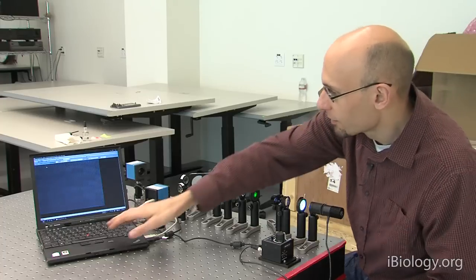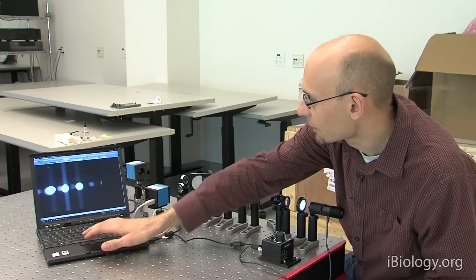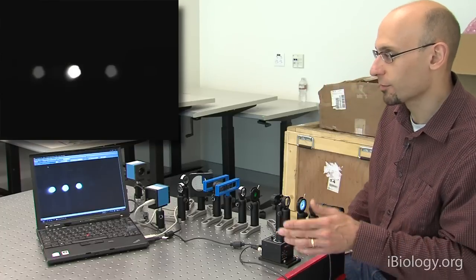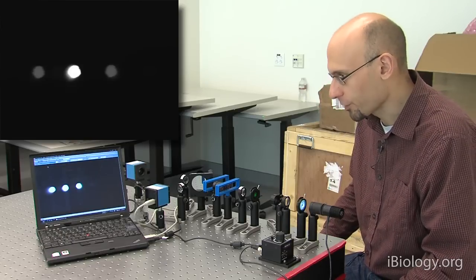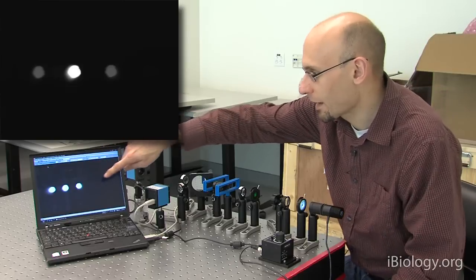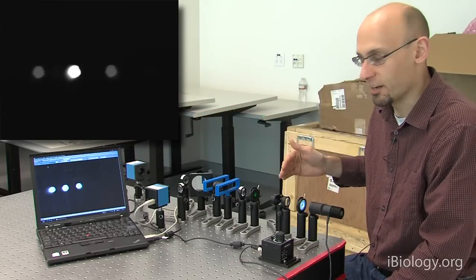So if we now flip to the back focal plane camera, you will see that these more closely spaced lines correspond to much larger diffraction angles. So first thing to learn from this experiment is that position here in the back focal plane tells you something about the size of your features in your sample.